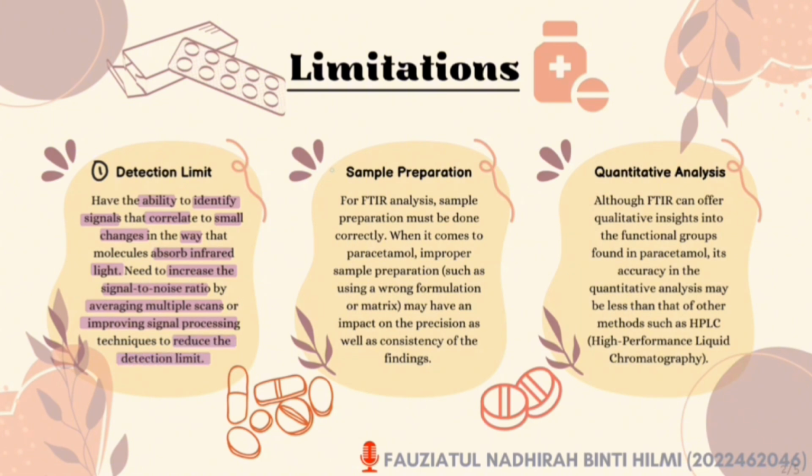Another limitation for FTIR analysis is that sample preparation must be done correctly, because when it comes to paracetamol, improper sample preparation, such as using a wrong formulation or matrix, may have an impact on the precision as well as consistency of the findings. Other than that, FTIR also has limitations on quantitative analysis.